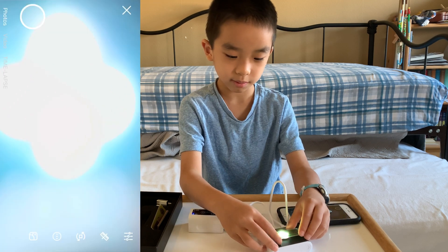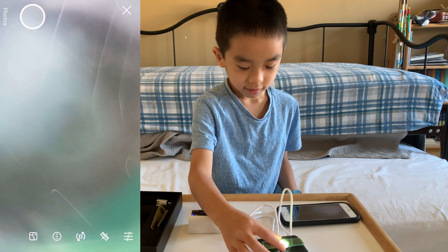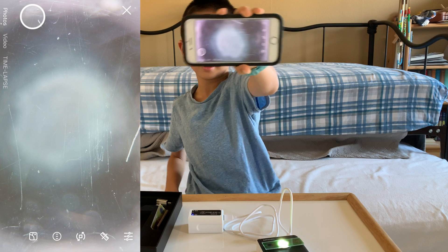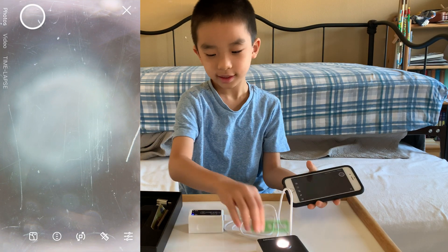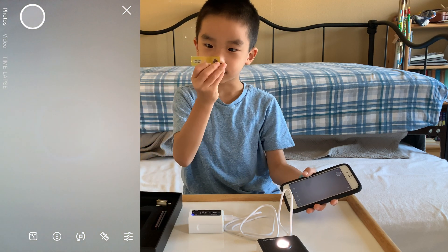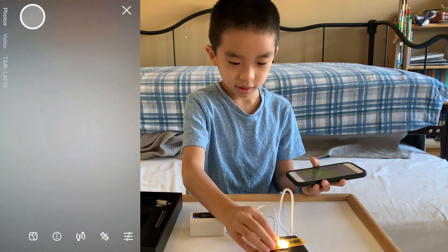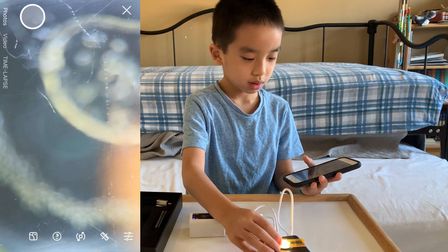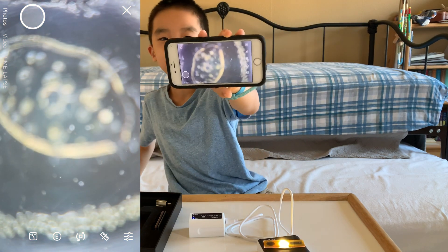First we put the potato starch in. Here's the potato starch — that's real big. Next is the camellia pollen. We put it in. It's that thing over there — that's the pollen.